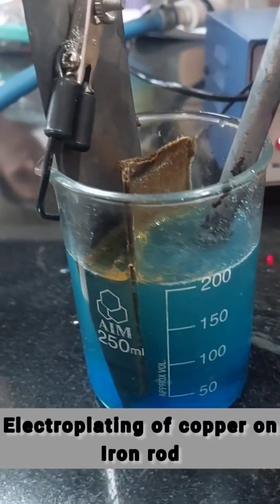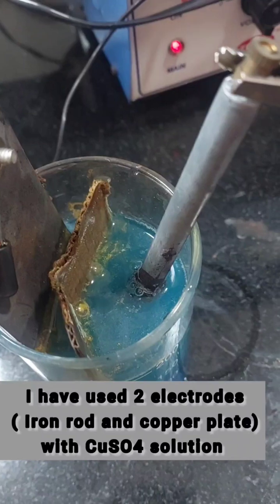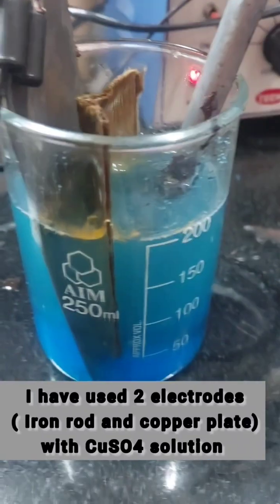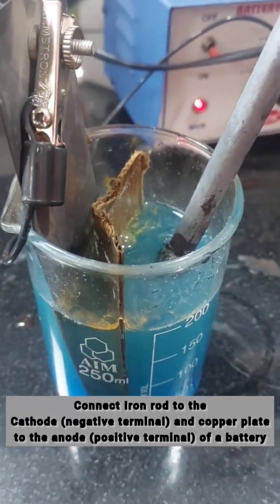Here I will show you how copper is electroplated on an iron rod. I have used two electrodes: an iron rod and a copper plate, with copper sulphate solution as the electrolyte. I have separated them with cardboard to prevent physical contact between them.